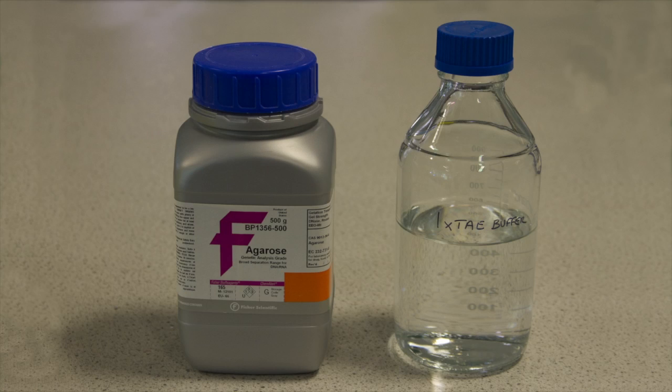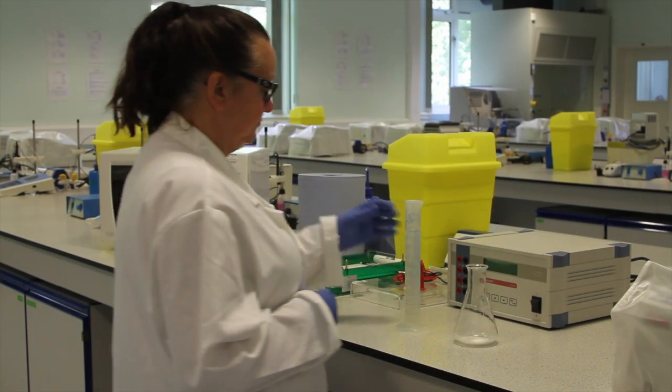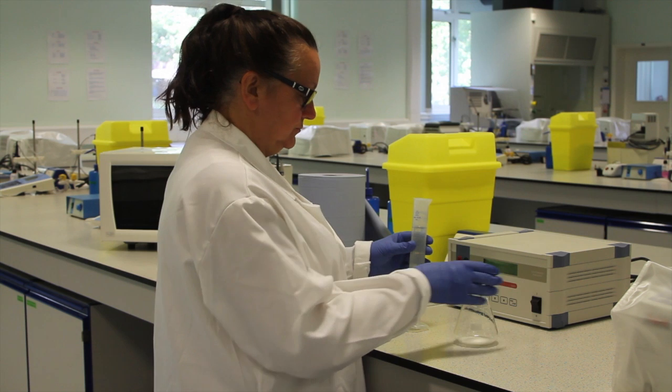The gel is prepared to a defined concentration given as percentage agarose, which is in grams per 100 milliliters of TAE or TBE buffer. The higher the percentage, the smaller the pores that are formed and the smaller the DNA fragments that can be separated.